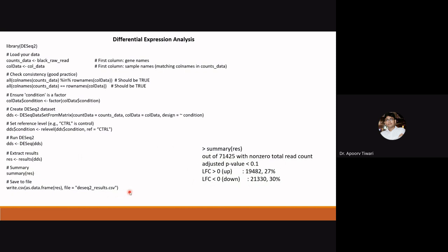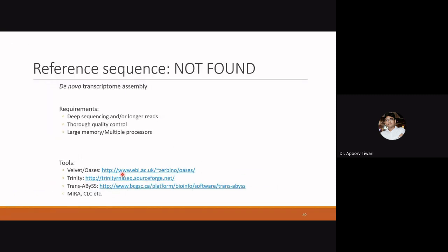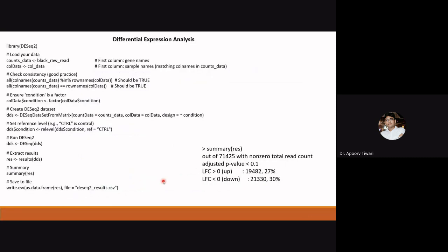In general, for using data for further analysis, the p-value we should use is 0.05, and the log fold change is approximately 2, a minimum log fold change value of 2 we have to use. So this is the total analysis by reference-based analysis.